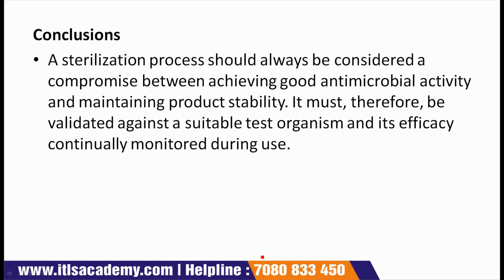So all the required techniques of the sterilization we have completed till now in 4 parts of this particular topic. So now we will see conclusion of all these sterilization techniques.